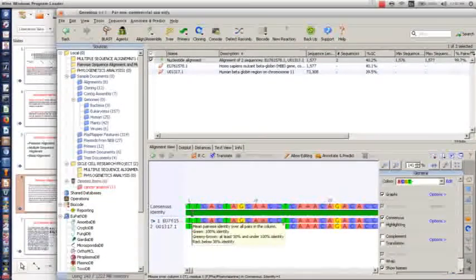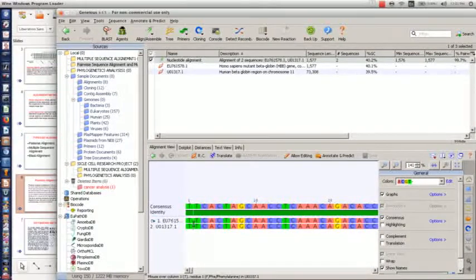Now I already told you what alignment is all about, and alignment deals with seeing the same nucleotide bases that a particular sequence shares with another. So as you can see here, this area is aligned, and the graph here is making us understand that truly this area is aligned, and this is the consensus sequence. Now the consensus sequence is the result of these two sequences, being determined by the normal sequence. Are you getting what I'm saying now?